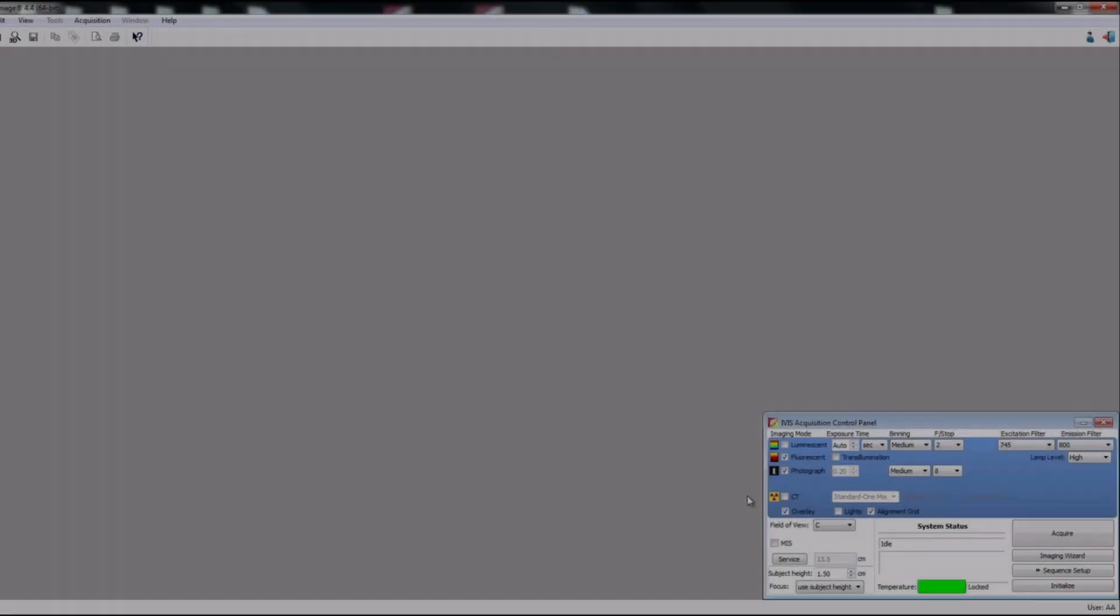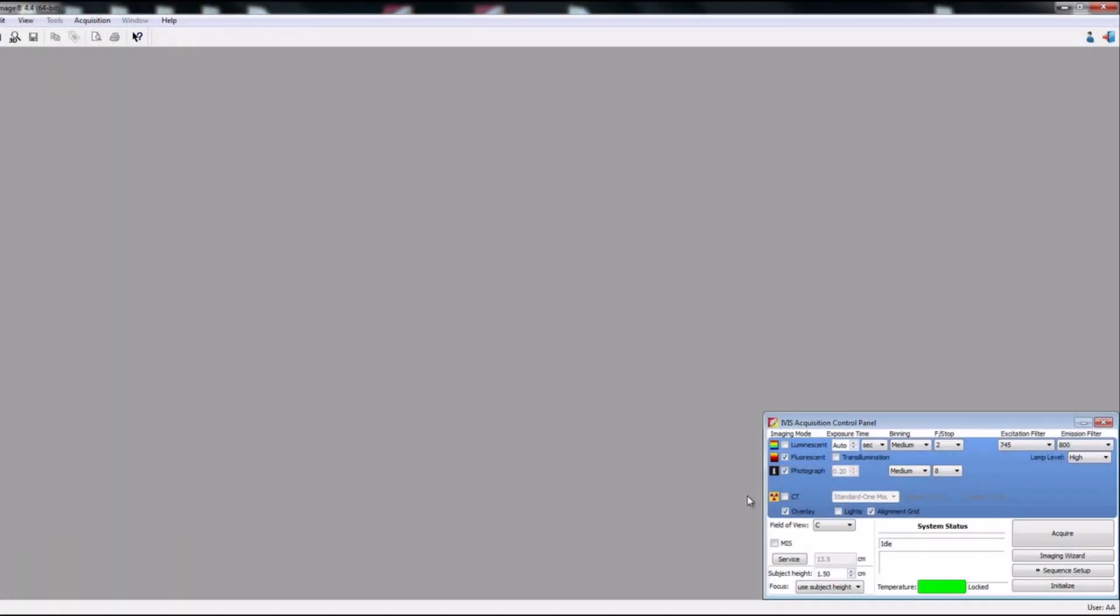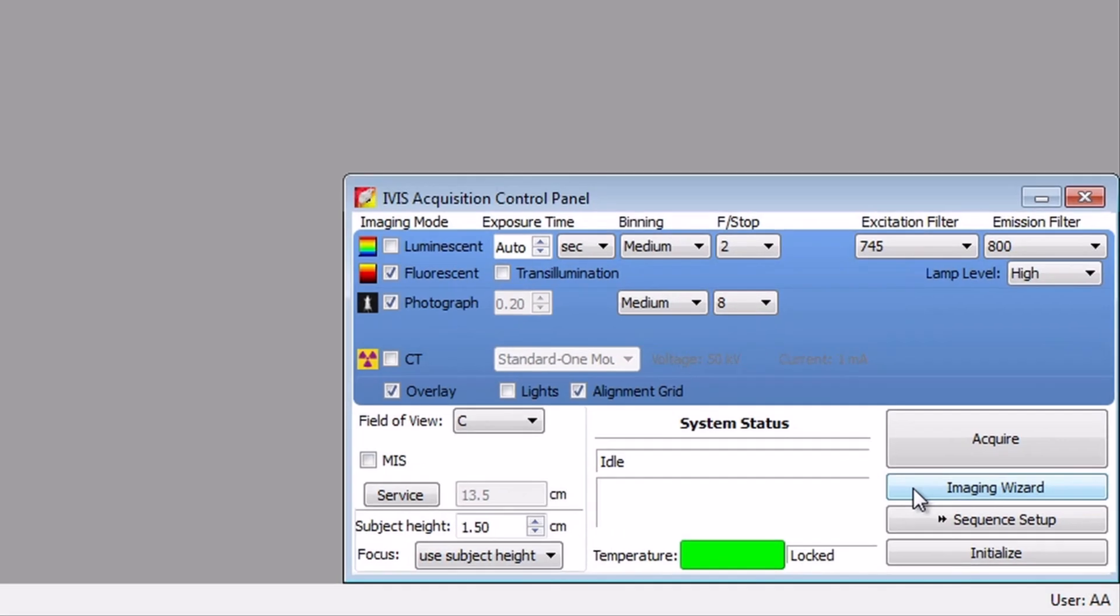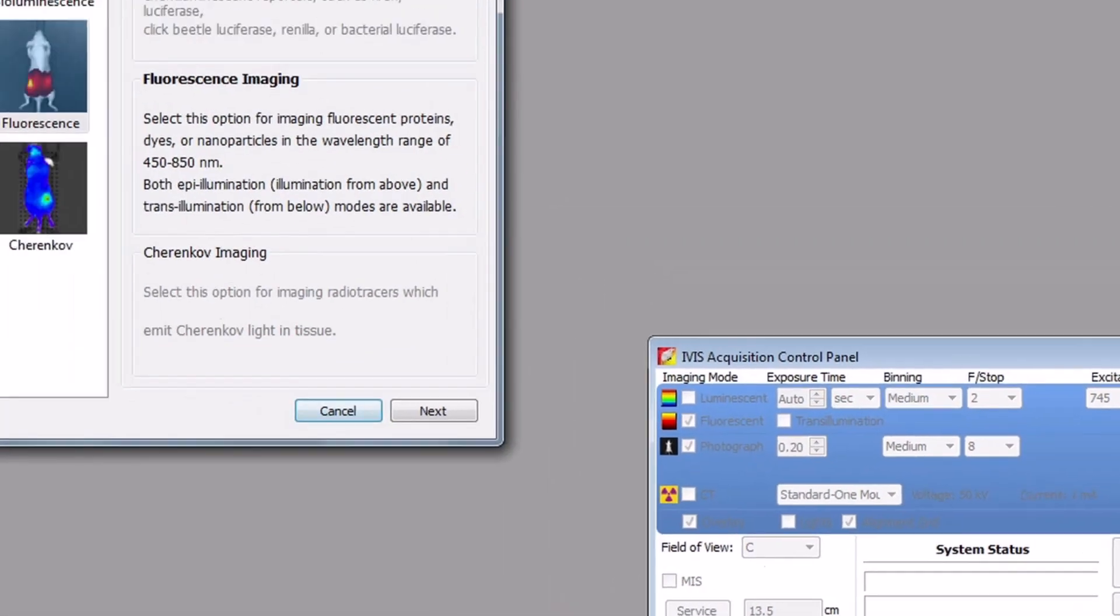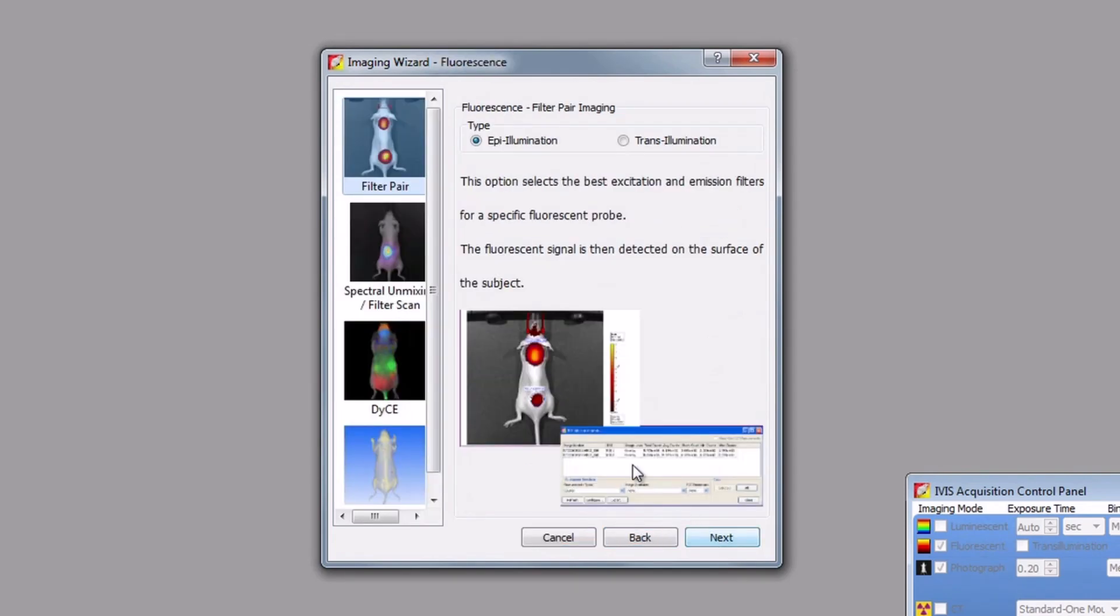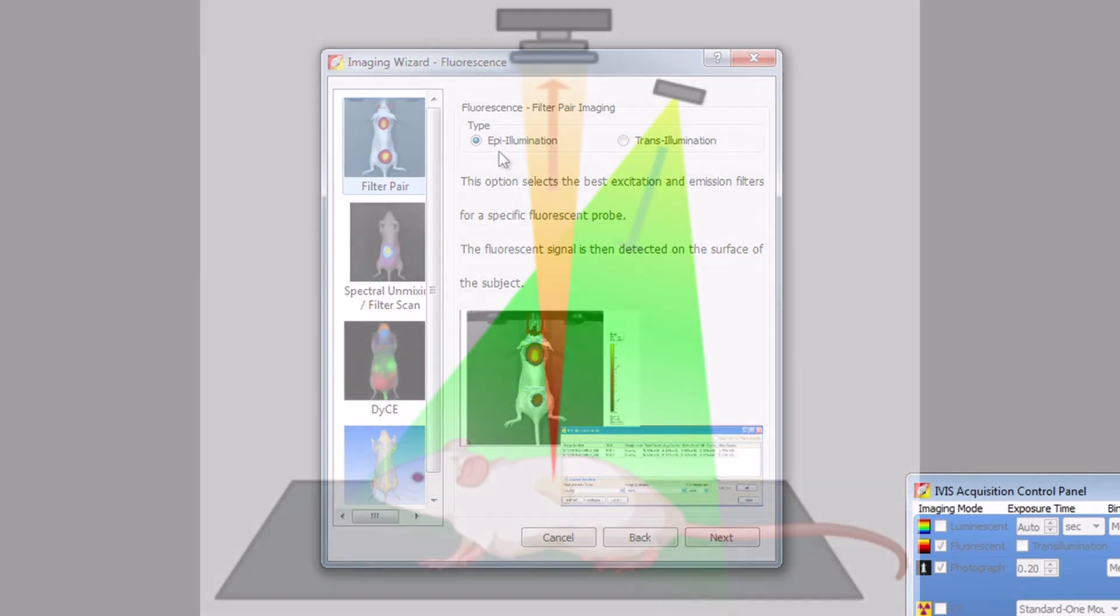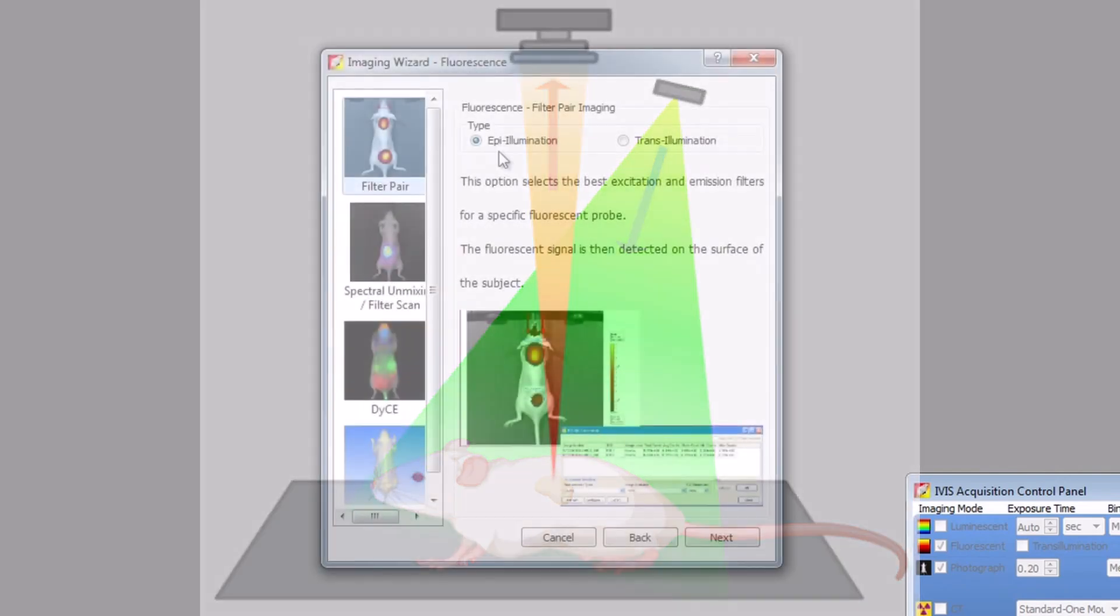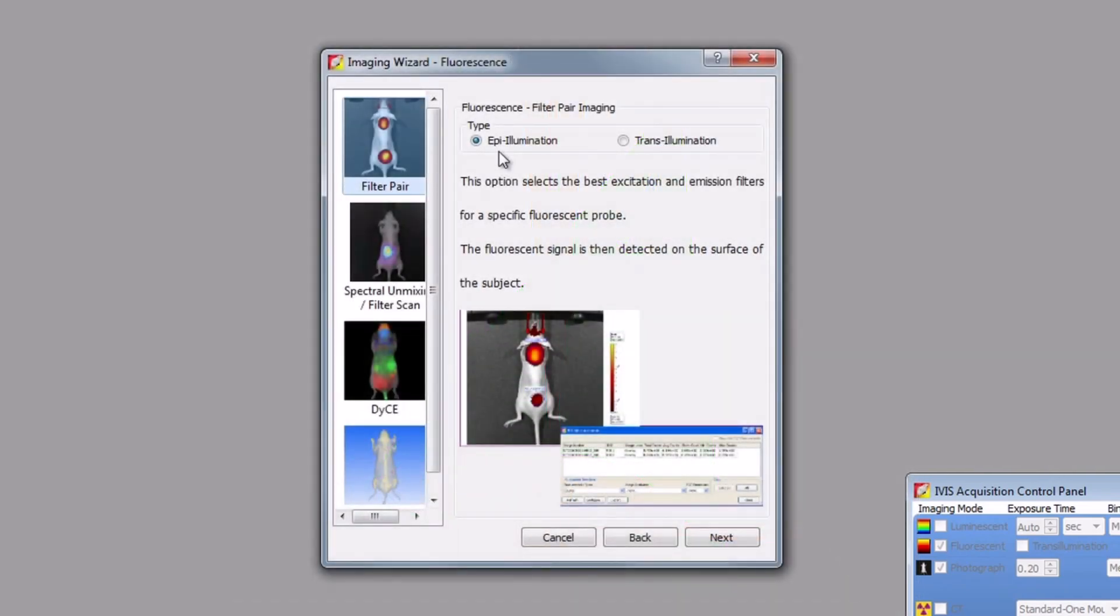For fluorescent acquisitions, we recommend using the imaging wizard for setup. It will guide you through the setup of your fluorescent acquisition and assist you with proper filter selection. To begin, select the imaging wizard button from the control panel. The imaging wizard setup screen will appear. Start by clicking the fluorescence option. In the second screen we select filter pair and epi-illumination. This is reflectance illumination, meaning that the light will be projected from the top of the instrument onto the stage. Select next at the bottom right-hand corner of the window.